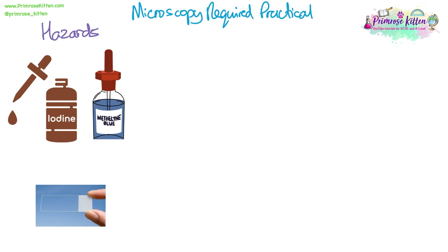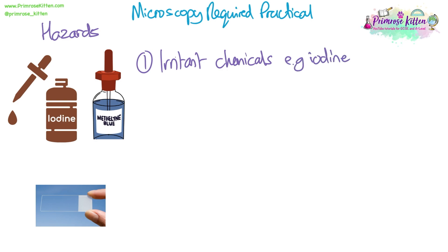First of all, let's go through the hazards of this practical. We're going to be using stains, which we need in order to be able to see structures that we're looking at under the microscope. For example, iodine is the main one, especially if you're using plant cells. These are all irritant or harmful chemicals, so we must wear goggles when using these at all times.